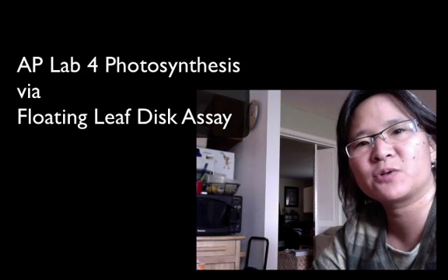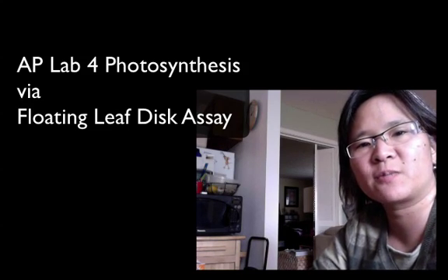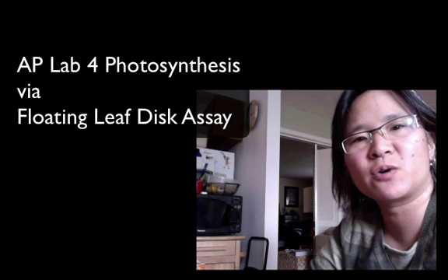Hello AP Bio students. I'm going to go ahead and show you how to set up the floating leaf disc assay for lab 4 photosynthesis.